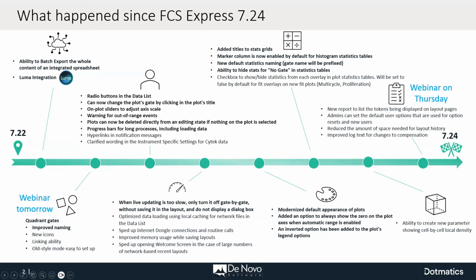For example, we have integration, like new export capability. We have interface and user experience, I would say usability overall. A few new features about statistics and tokens. New features for regulated and validated environments, so for clinical people, CRO, and so on.